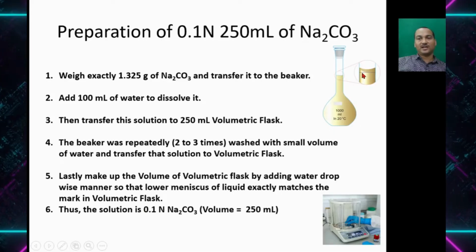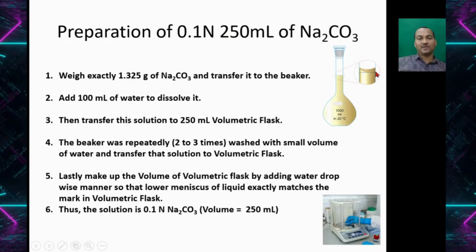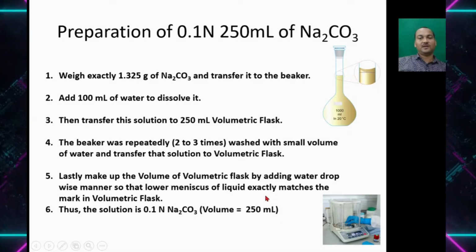So you can see the mark here. So the lower meniscus of the liquid should exactly match with this mark. So thus the solution is 0.1 normal sodium carbonate and the volume is 250 ml.